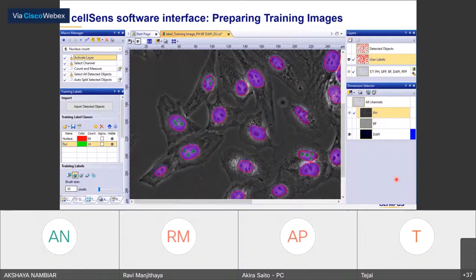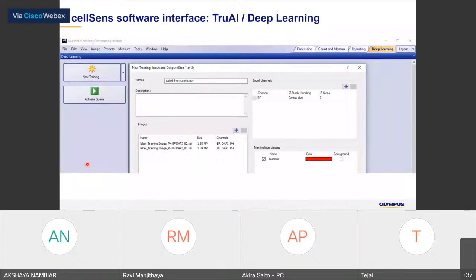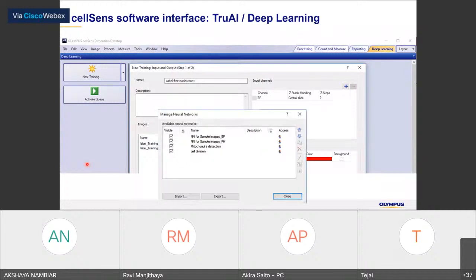So I'll cover this one by using our software later. I have a software in my PC so that I can show you how our training will work. But anyway, we need to have some kind of training label to identify what kind of objects they are, and then give that to the neural network training.